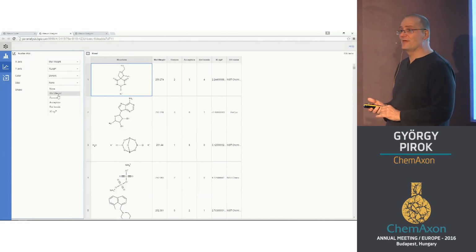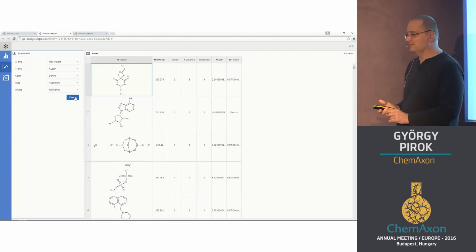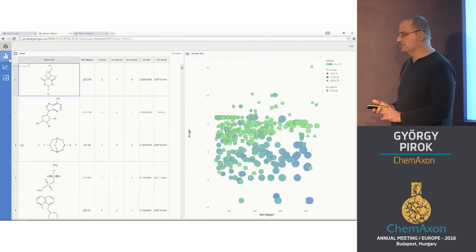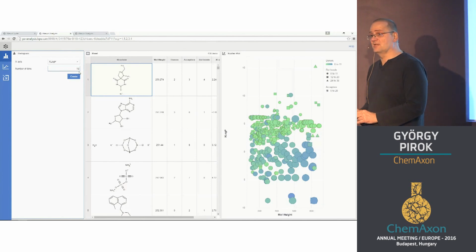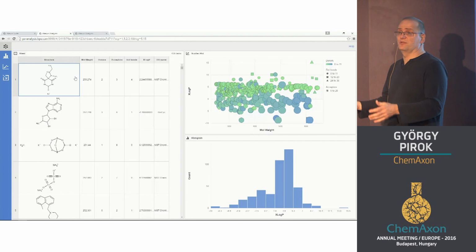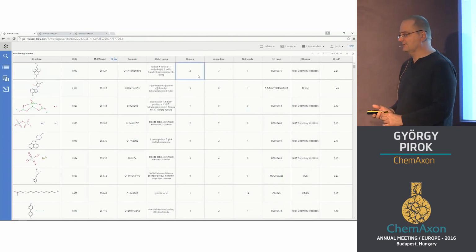You can create charts. So here we create a scatter plot chart, which has 5 dimensions at the moment: X, Y, color, shapes, and size. And since we selected a numerical field for the color, it's automatically a gradient by default. And we can create other visualizations more than once, so you can have more charts. It's a similar look to Plexus Connect.